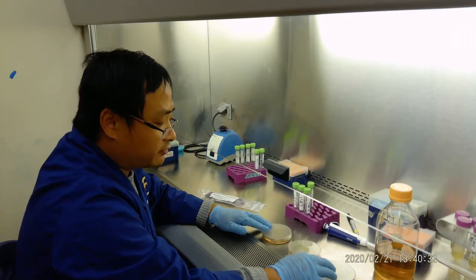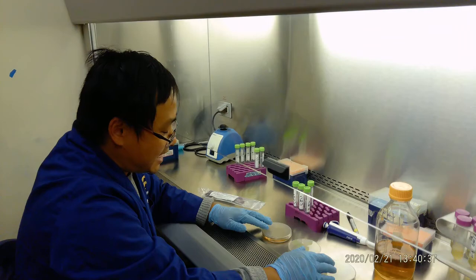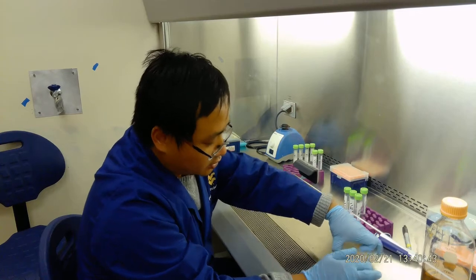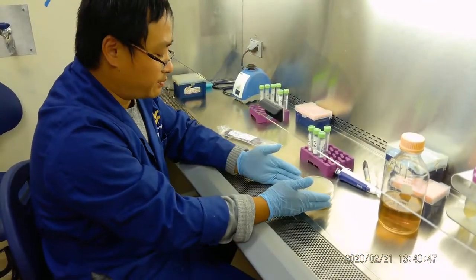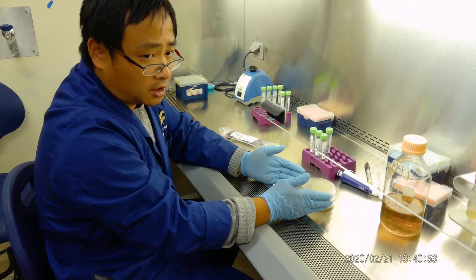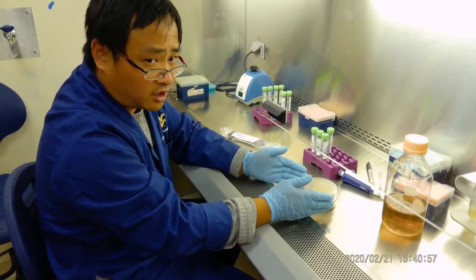So that's in the industry. It's really helpful, and safe for some quick testing, absence or presence, and also some small scale quantitative tests. Okay, so we will stack them together, but we will leave these on the bench for about half an hour to 1 hour. Once it's solidified, then we put it in the incubator to incubate another 24 hours.